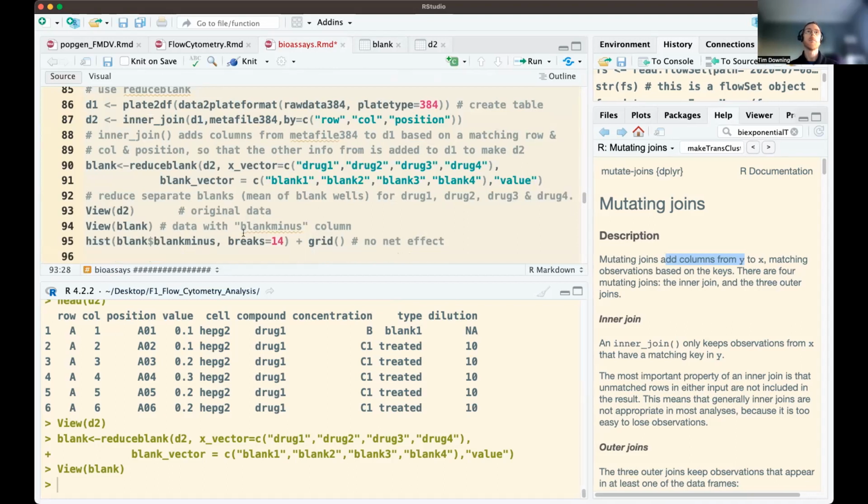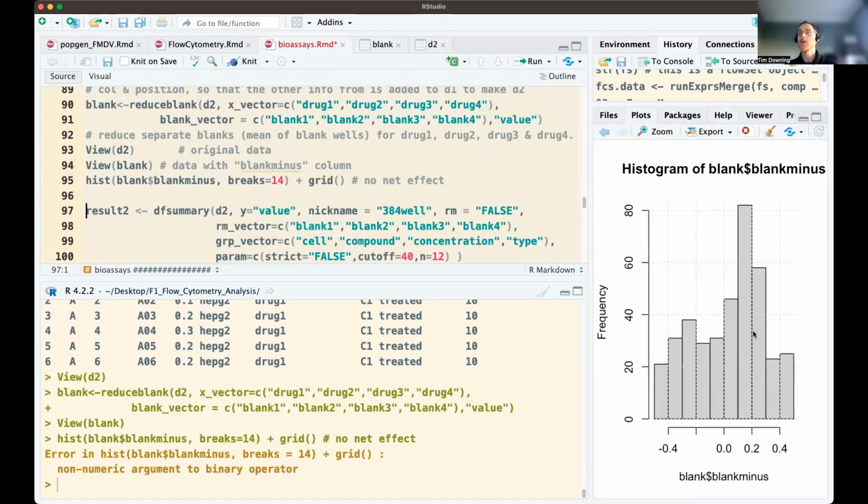So we can view that histogram of that data for the blank noise column. So you can see that's adjusted for the effect of the kind of background, but the net effect is 0. So it should improve the accuracy of our data without changing the underlying values.